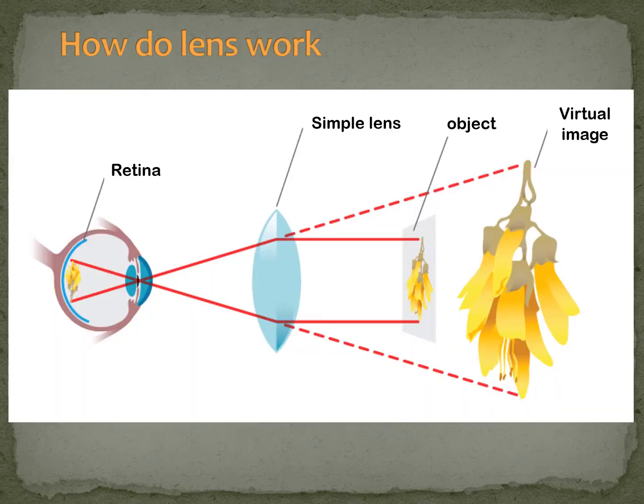So these characteristics of light, in particular refraction, are in a sense what makes a lens work. As you can see in here, if we have an object that we want to observe, the light that is transmitted and moves in the direction of the eye, when it reaches a lens, and this is a simple lens, we will talk about different types of lenses in the future, light is refracted, and it will reach, in fact, a second lens, the lens of the eye, and it will be focused on the retina of the observer.